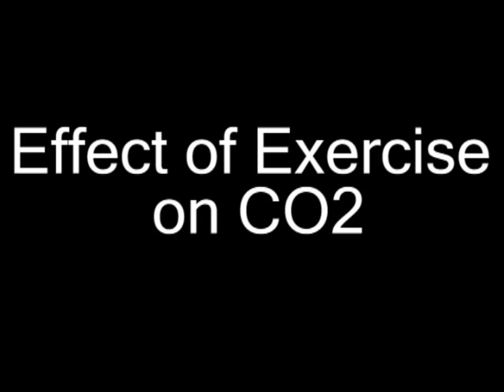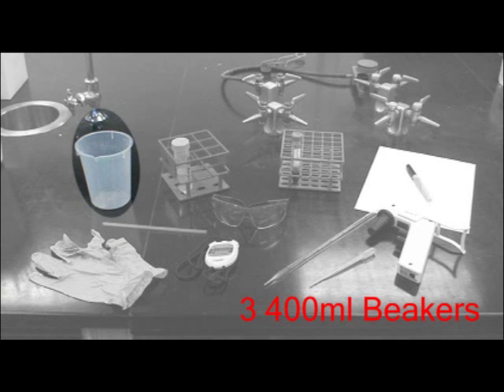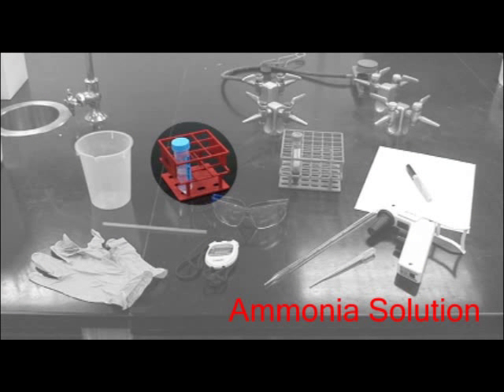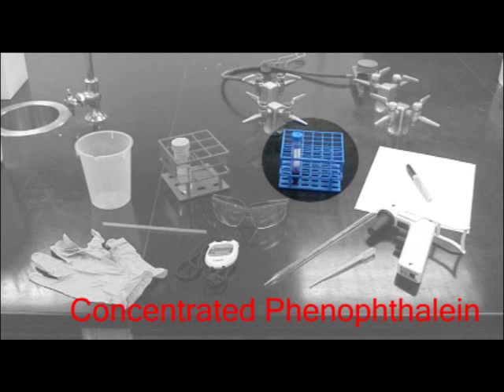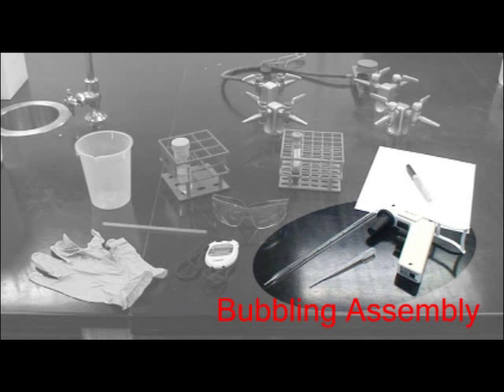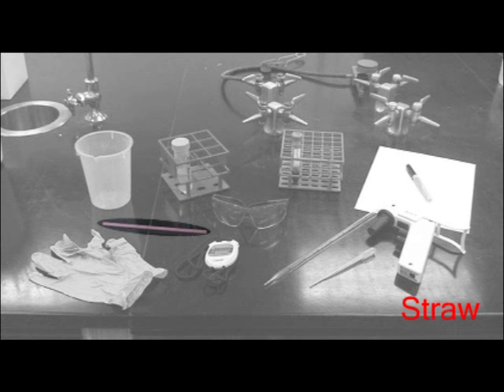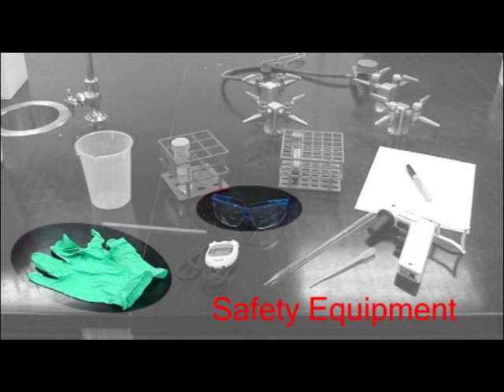Effect of Exercise on CO2. For this lab, you will need three 400ml beakers, ammonia solution, concentrated phenolphthalein, a lab notebook and pen, a bubbling assembly, a timer, a straw, and safety equipment.